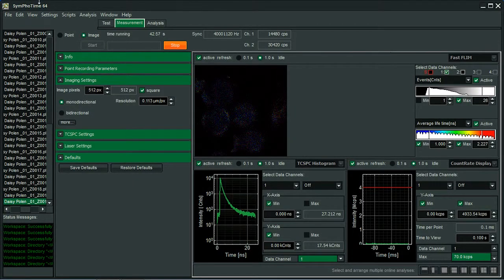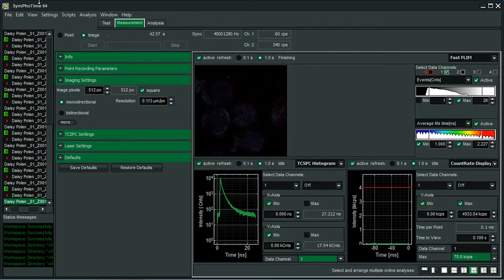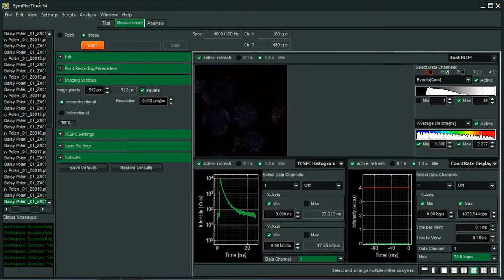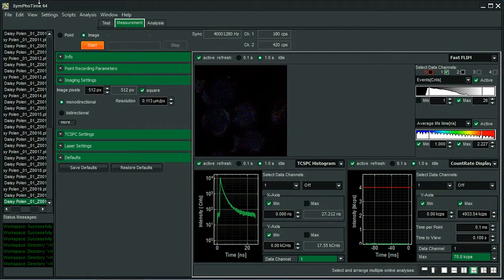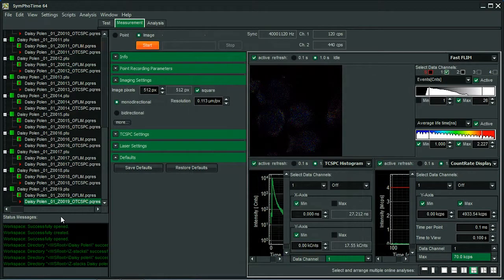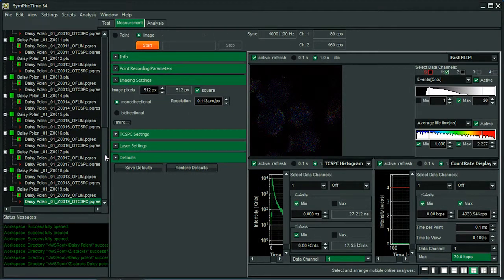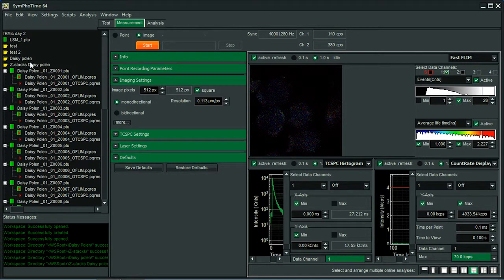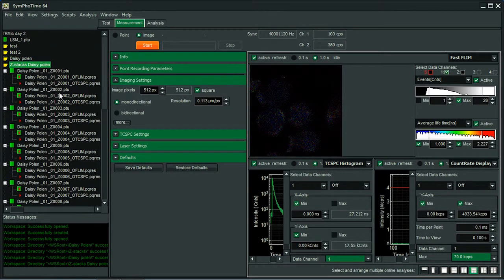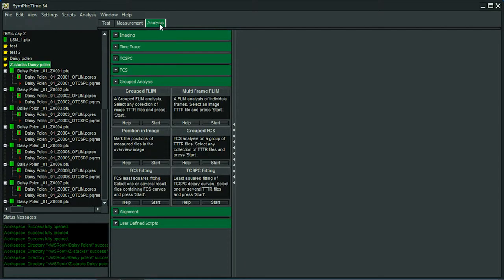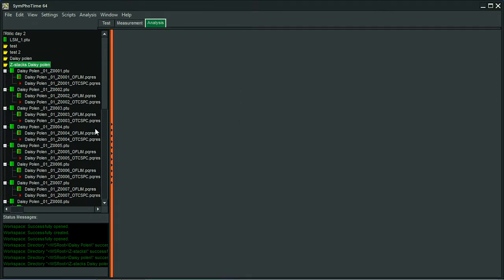So once the acquisition has finished, all the data are gathered in the folder. I think we should add name z-stack daisy pollen. So I select it. I go to analysis, and then I go to group analysis, group flint, and I click start.